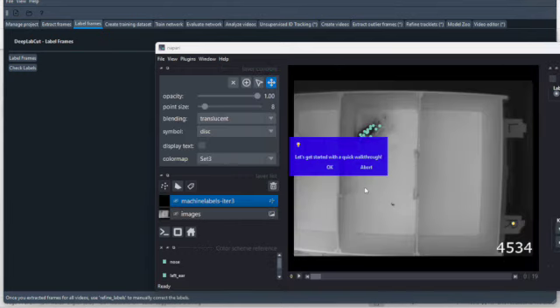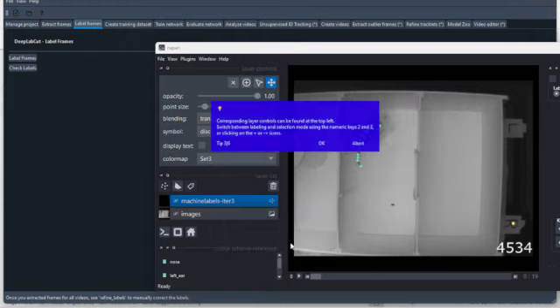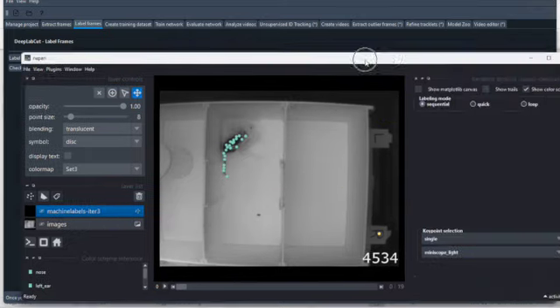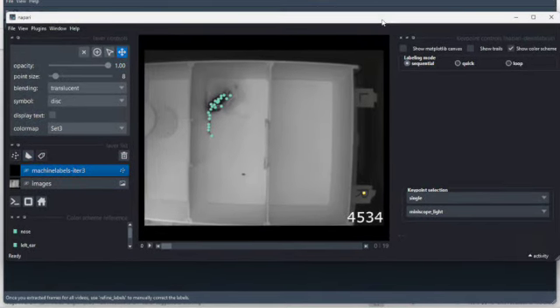And this is the GUI for labeling. It's going to walk you through how to use it. Okay, so it's like a step-by-step guide. You can read this on your own about all the different parts of the labeling GUI. That will pop up every time, so you can always select abort if you don't need to review that.